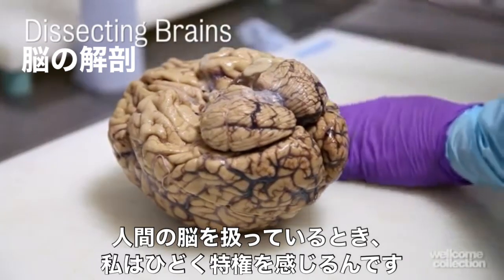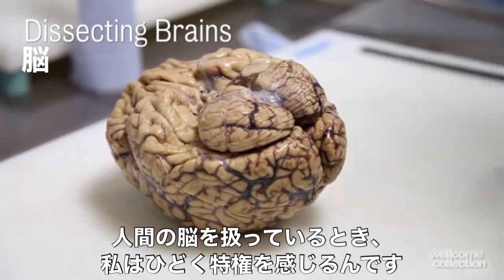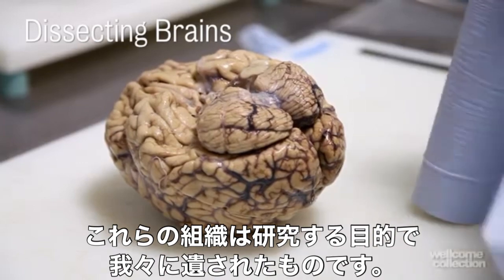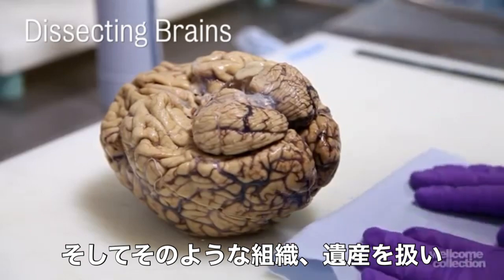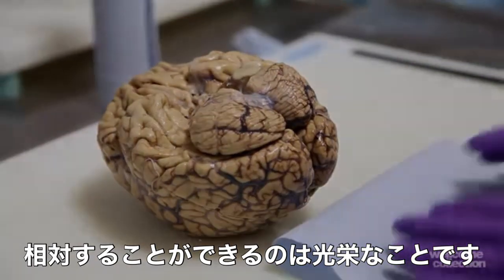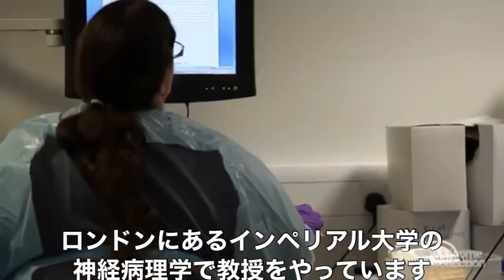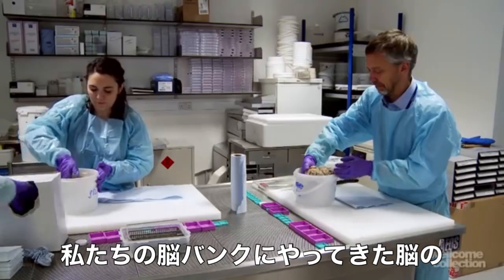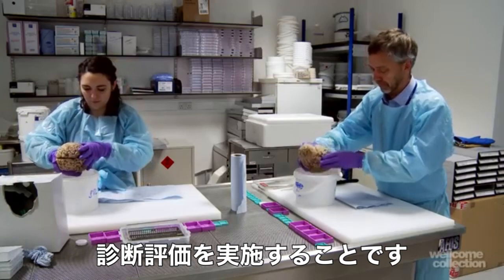I feel terribly privileged when I'm handling human brains. This tissue is something bequeathed to us for research purposes, and it's an honour to be able to handle the tissue and meet that bequest. My name's Steve Gentleman, I'm the Professor of Neuropathology at Imperial College in London, and one of my jobs is to carry out the diagnostic assessment of the brains that come into our tissue bank.